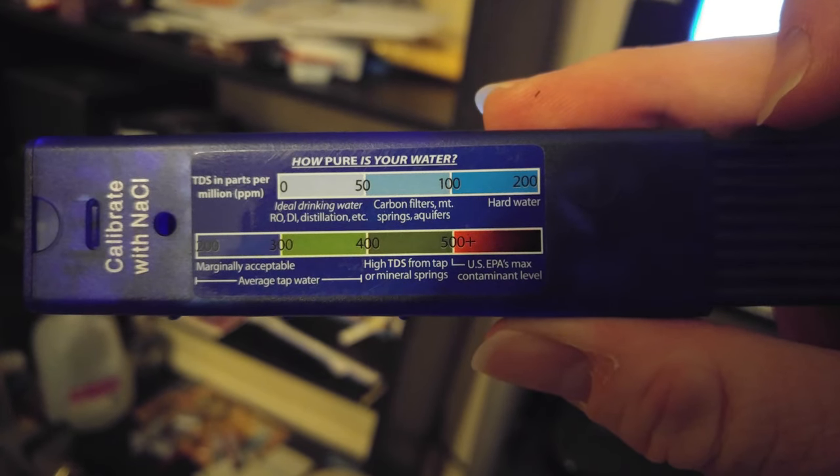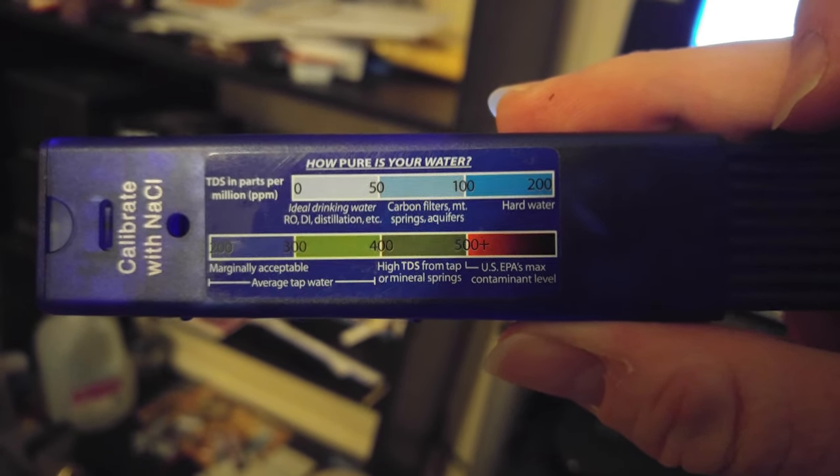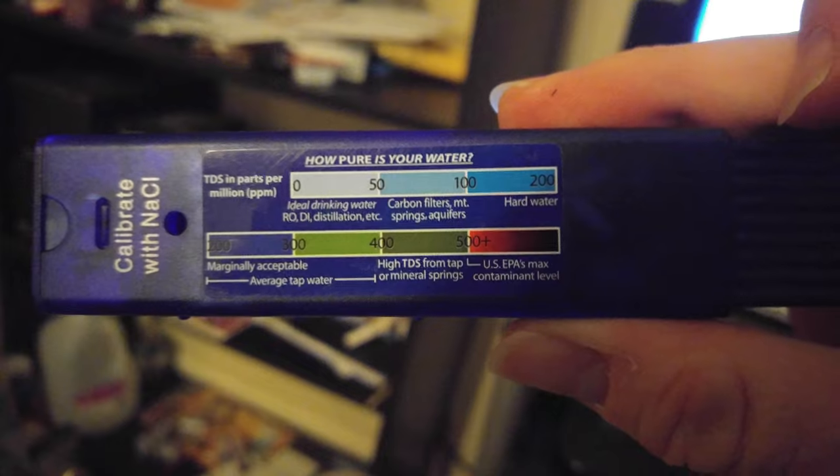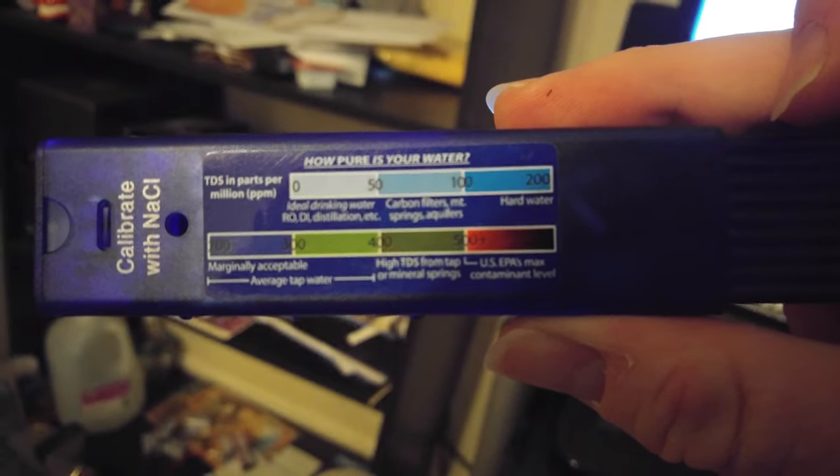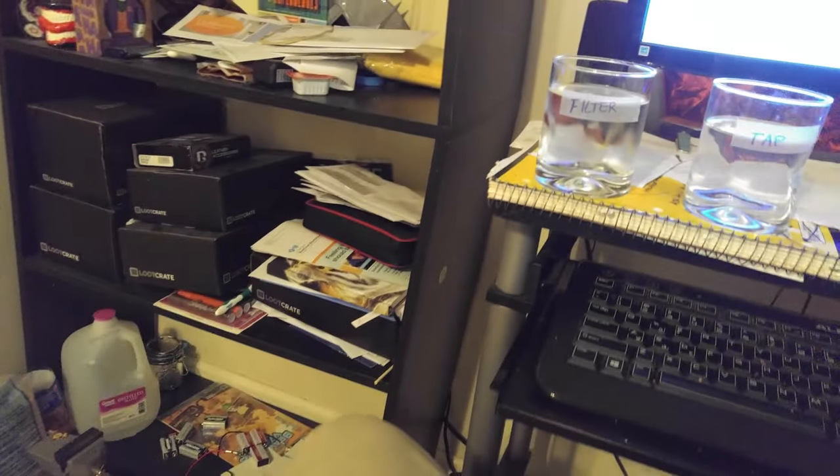So it's in the acceptable range. Okay, so let's try the filtered water.